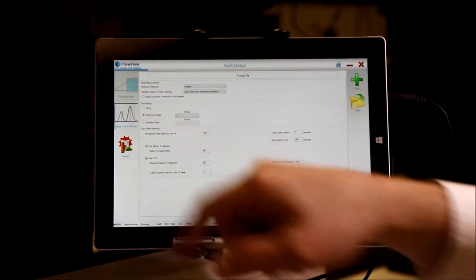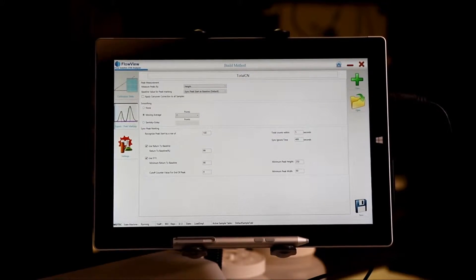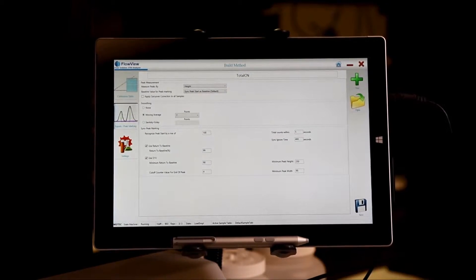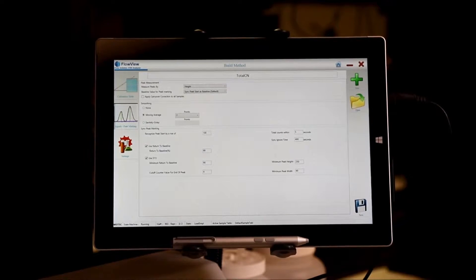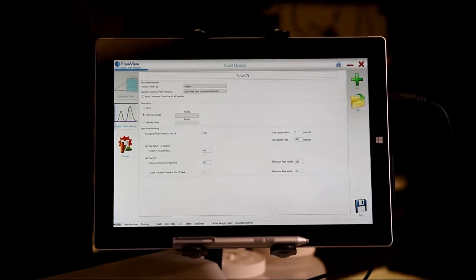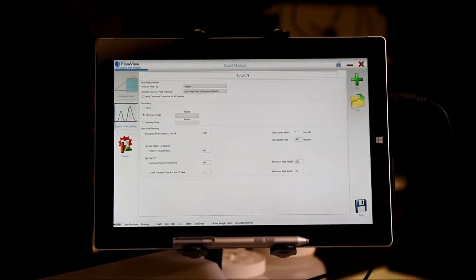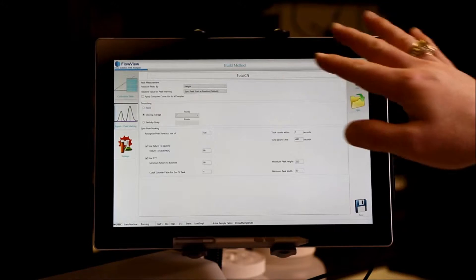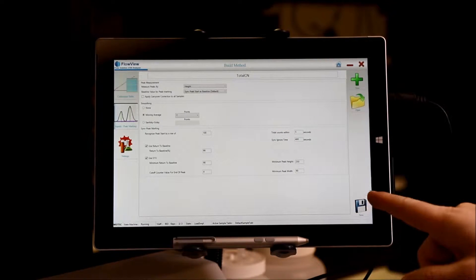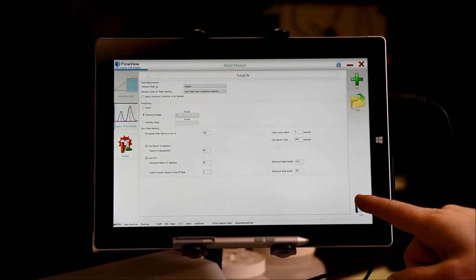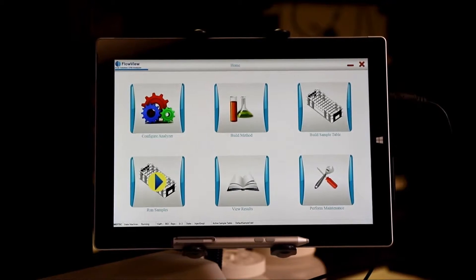You also choose how you want to quantify your peaks either with height or area as well as how to determine whether a peak has been detected. Once you set everything correct on this screen, you press save and you return to the home screen.